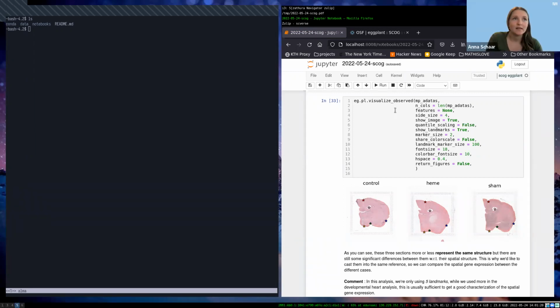Thanks. The next question would be on the limits of the heterogeneity that Eggplant can handle. In terms of tissue types, modalities, or the orientation, if you could comment on that. Was the last part orientation? Yes, orientation. Orientation shouldn't be any issue at all. That's just a linear transformation that is super easy to handle. Tissue type and different modalities.